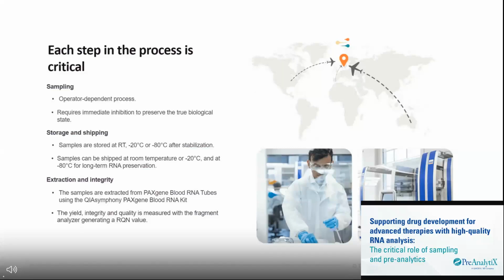And of course, we have implemented quality control at every step. That means that from the sample receipt to the data reporting, we apply rigorous quality checks to ensure accuracy, reproducibility, and compliance. This whole structure is very essential to ensure data quality and reproducibility, especially when you're handling clinical samples.